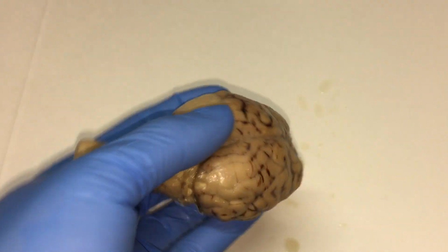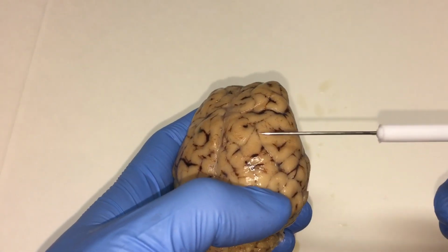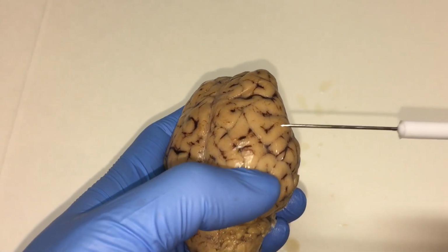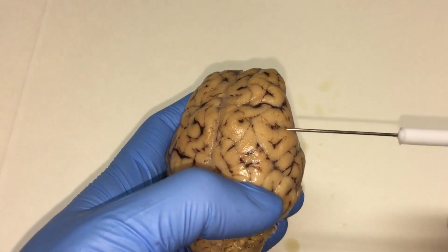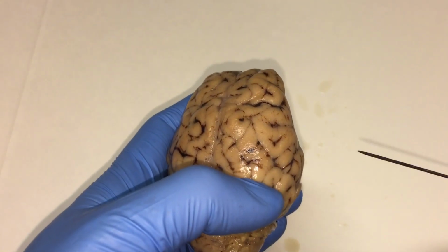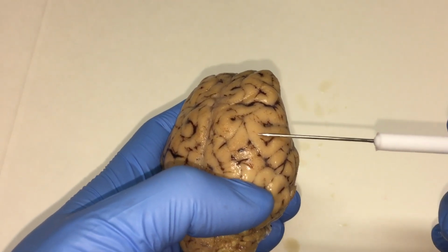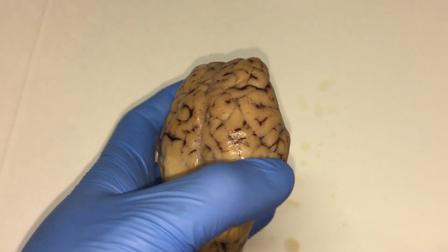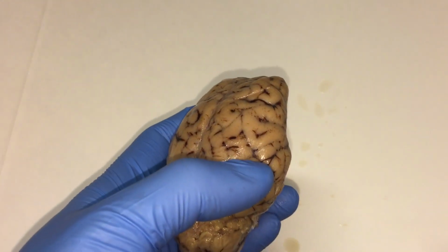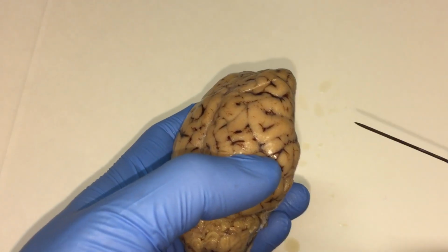So the first structure I want to point out are these lighter, flatter areas right here. So here's one, another, not the darker areas. So there's several of them. All of these together are called gyri. A singular one, like this one right here, is called a gyrus. These are often referred to as hills. So they're like raised areas on the surface of the brain.